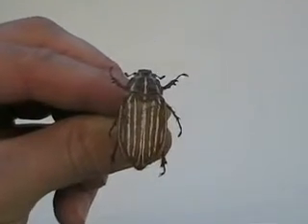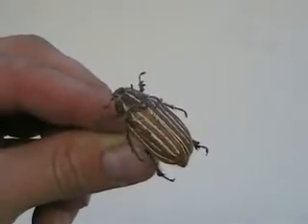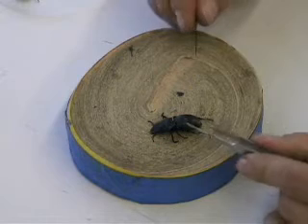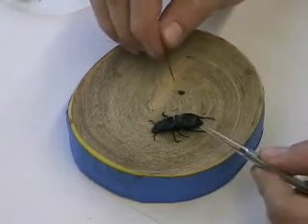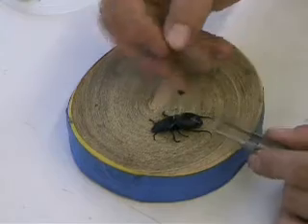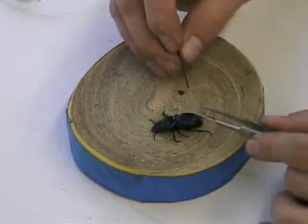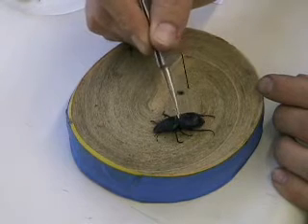With most insects you pin them through the thorax, but beetles are a little different — you pin them on the right side of the elytra. The elytra are the hardened wings on the outside of the body that cover part of the thorax and abdomen. You pin the right side so the left side remains visible for identification purposes. This is a ground beetle — a predaceous ground beetle in the genus Passimachus. Here is the head, here is the prothorax, and here is the elytra covering part of the abdomen and thorax.